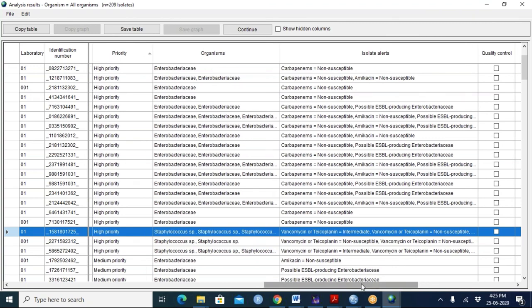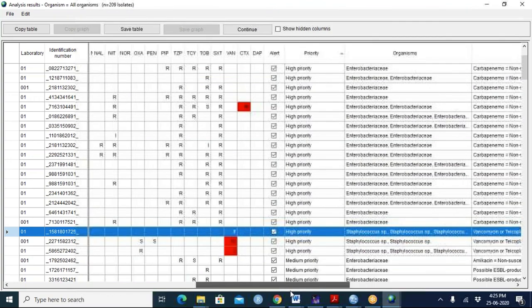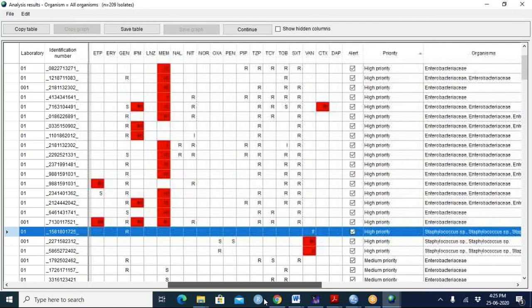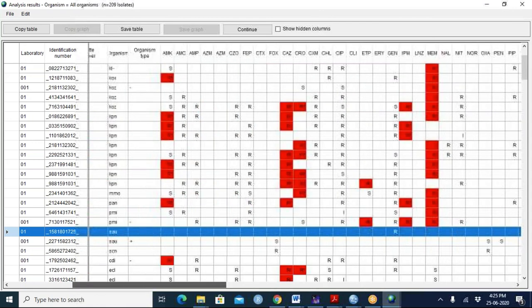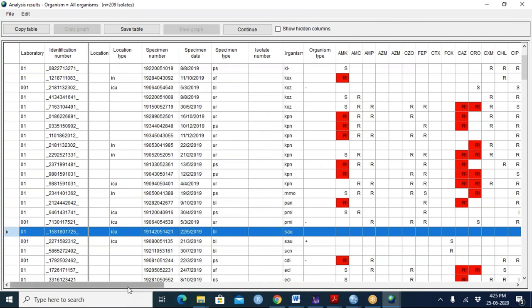Okay. Can you go back to the far left? Go back to the far left of the table. Obviously, the red is the actual alert, so you can see where the problem is. Go all the way left. Good. So I want to emphasize here, you do see the confidential patient data here. So this is a very valuable report for people inside the network with approval. Do not send this to anybody else, especially if there are names and things there.